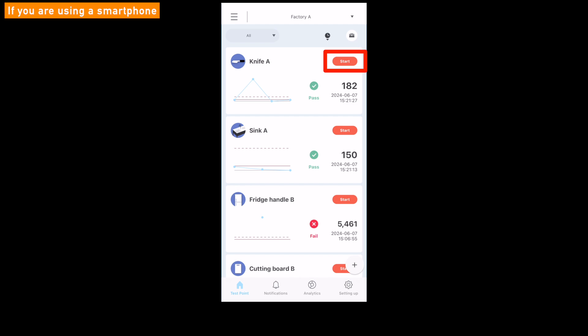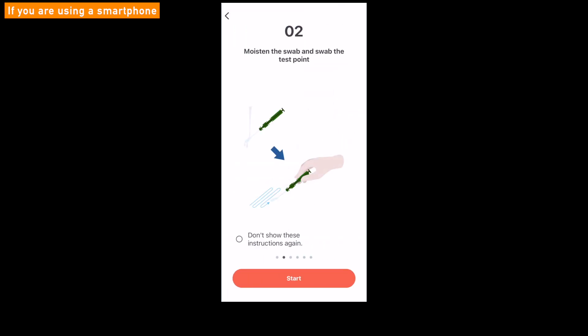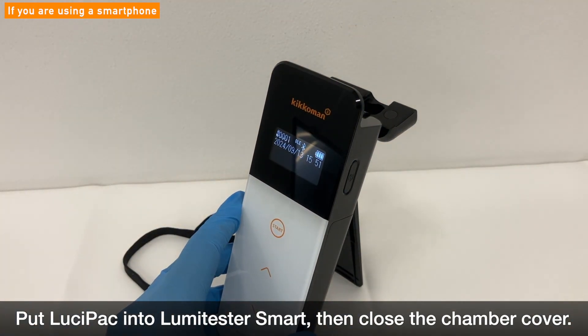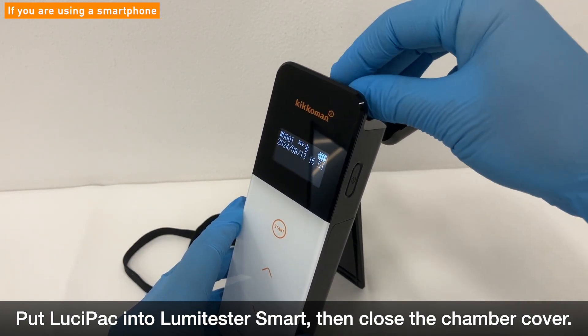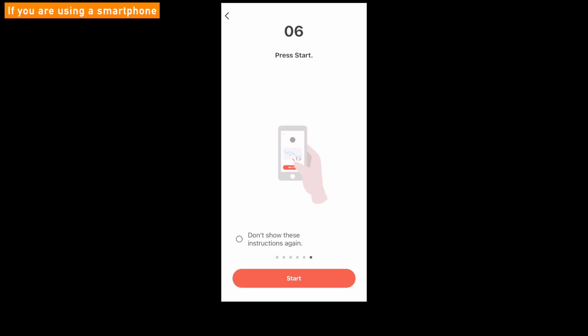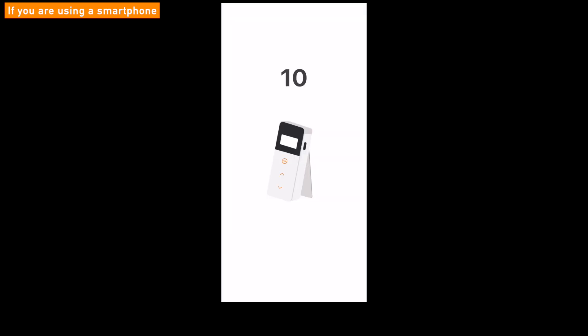Tap the red Start button to begin a test. A simple introduction about how to make a test with Lumetester smart and Lucipac will be displayed on the screen. Follow the instructions and insert the Lucipac into the Lumetester smart. After inserting the Lucipac and closing the measurement chamber cover, tap the Start button one more time to start testing. A judgment based on the benchmark value 1 and 2 will be displayed on the screen.